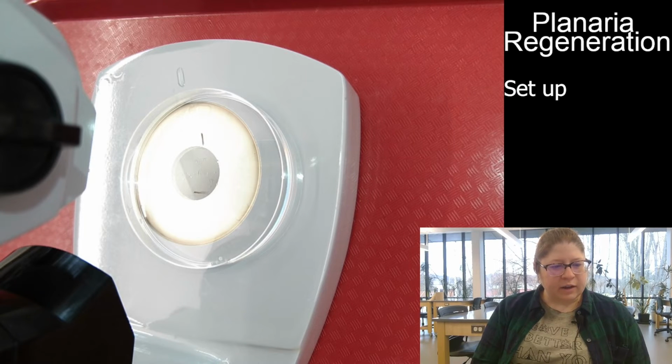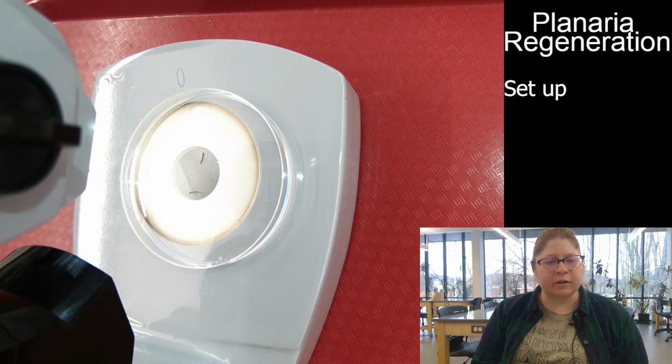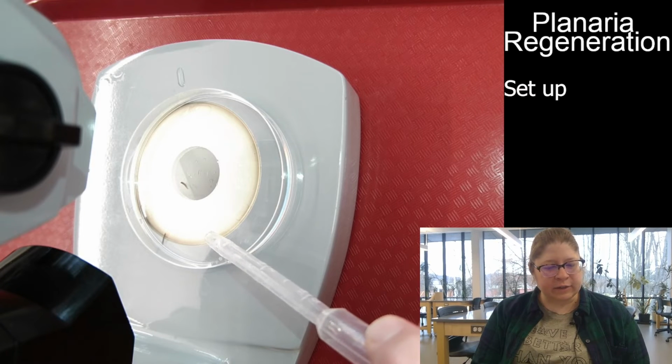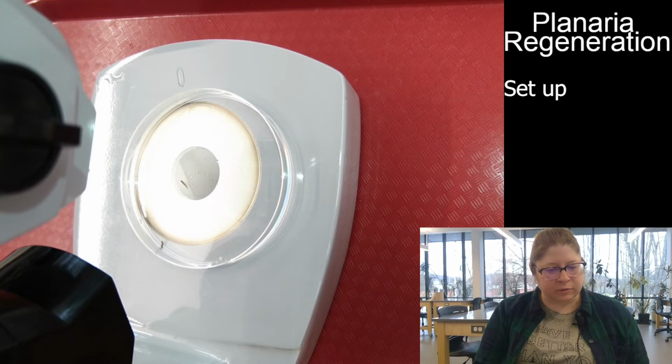They do not have a true central nervous system like we think of with mammals, but they do have ganglia in the head region and a nerve cord that runs from the head region down to the rest of the body. And the eye spots at the top allow it to see light and dark and to navigate its way around and search for food.